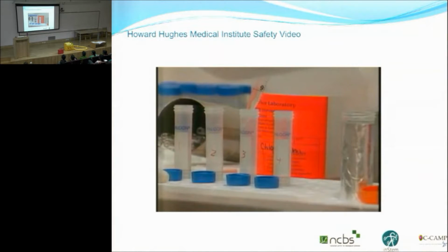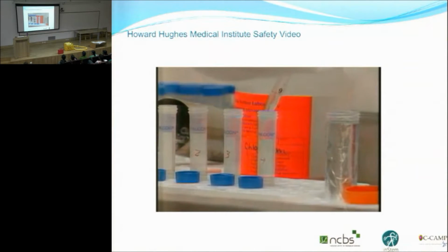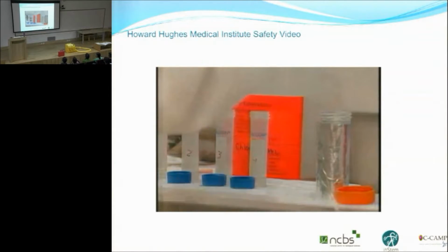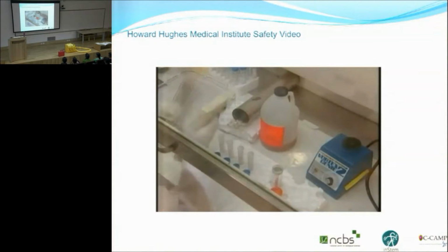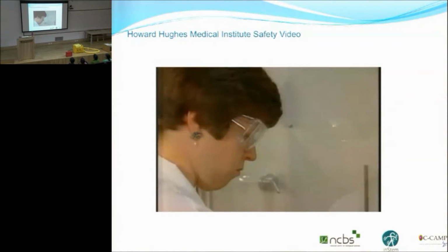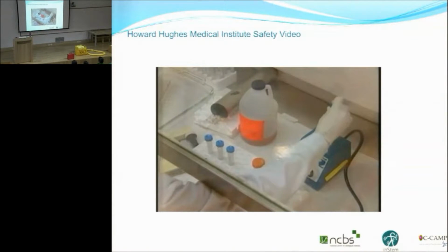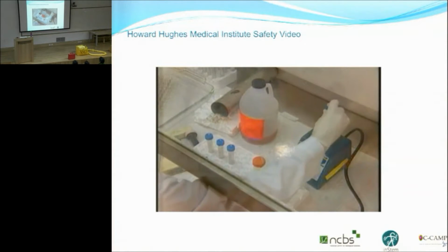Gretchen has performed this procedure many times. Otherwise, a dry run would help identify problems she might encounter with the workspace, equipment selection and layout, and with her dexterity. Note how she holds the cap as well as the tube to prevent it from unscrewing.